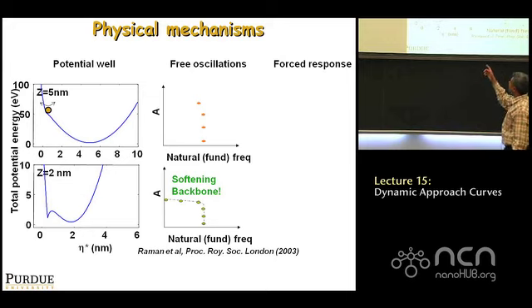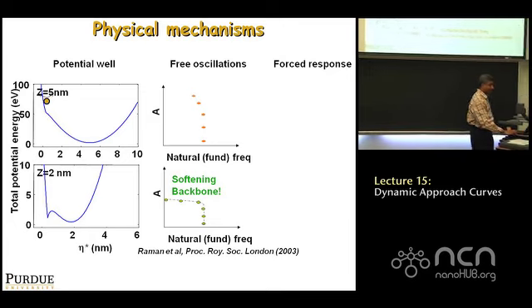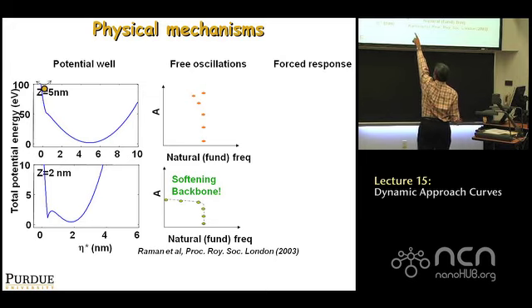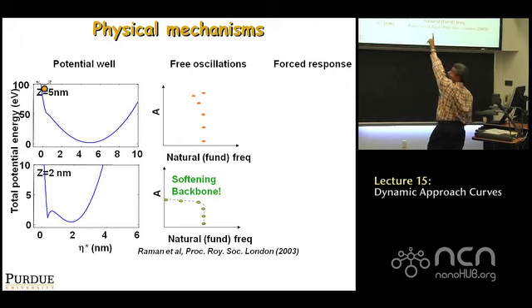So what you start seeing is, because of the tip-sample interaction potential, as you increase the amplitude of oscillation, the frequency starts changing. On the other hand, the frequency starts decreasing as you increase the amplitude. However, if you go back up and start choosing the ball to start rolling from up there in the steep part, you get a flip, right?